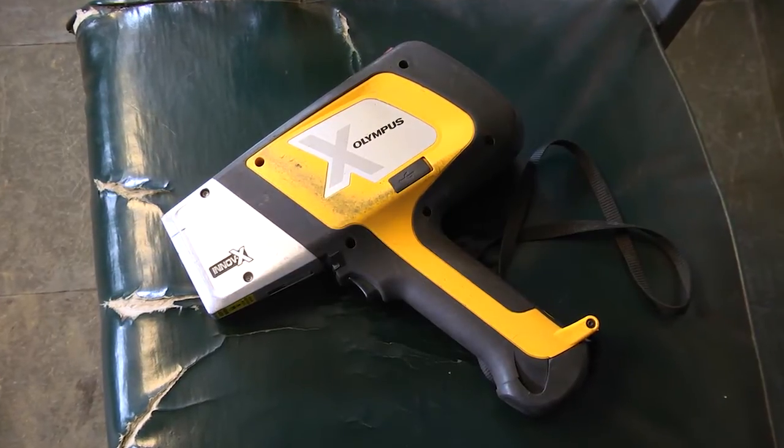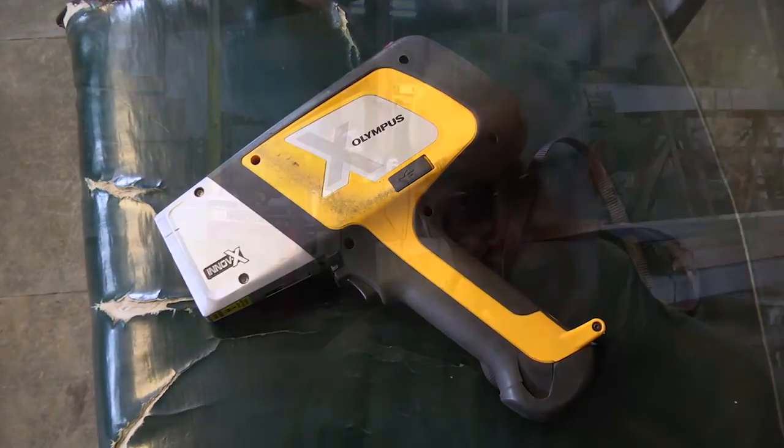They have a fantastic service department. We've had to send it in under warranty before. We get a loaner gun so we're not dead in the water. Without the gun, I'm not going to say the operations would cease, but we put a lot off to the side until we get that gun back. The gun is imperative to this operation.